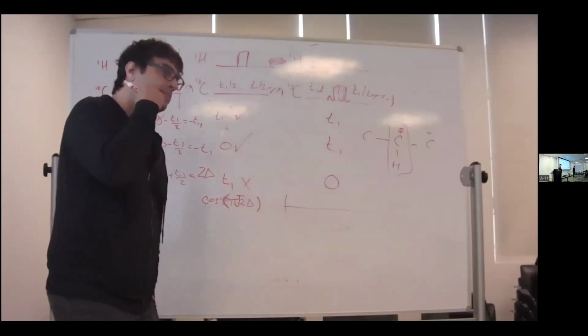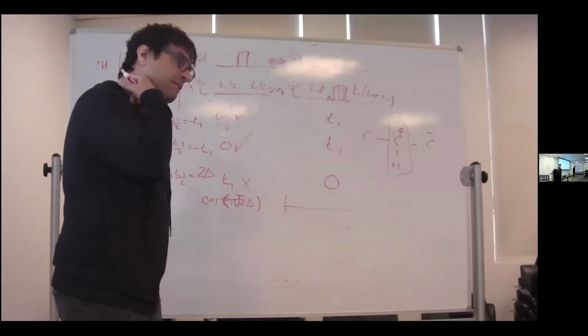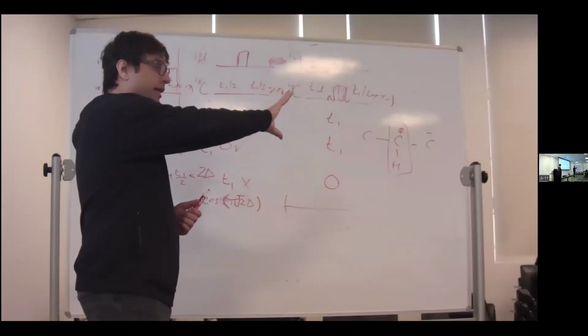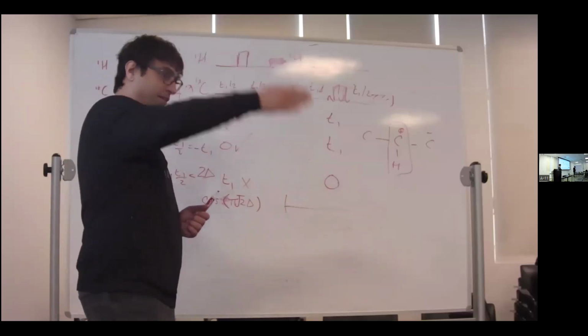So for regular HSQC, the T1 interferogram is this damped oscillation. And just Fourier transform that T2, then I get that. But for this experiment, it will be like the... You're absolutely right, it's not damped, because every point is the same.